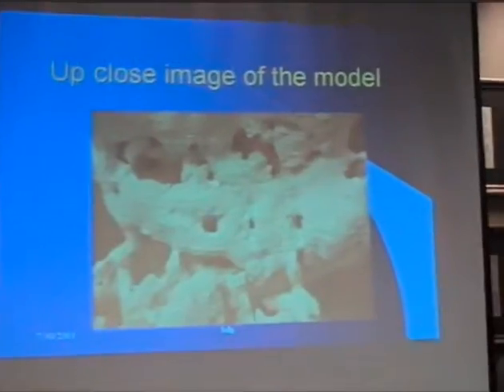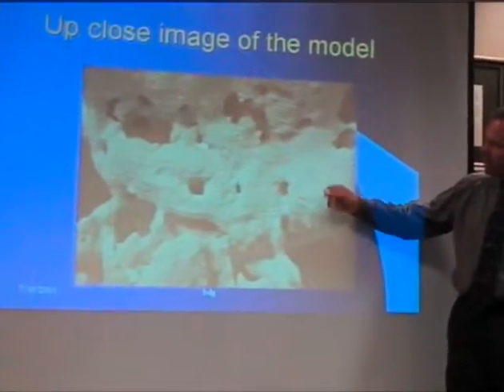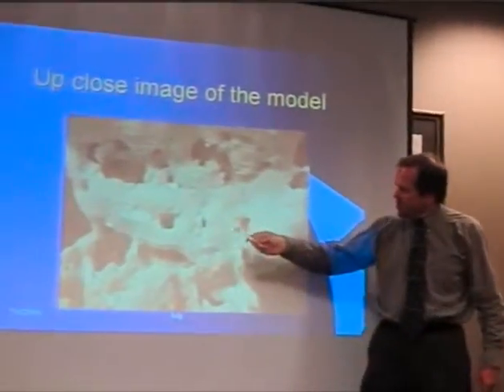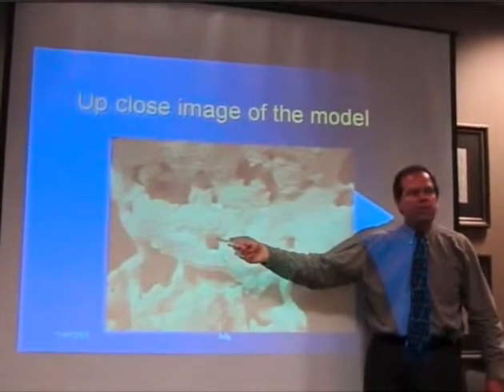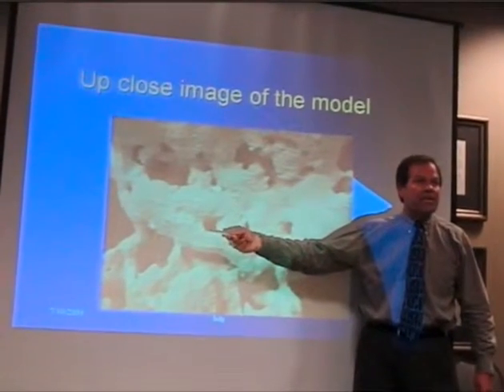And here's another piece. There's a fine detail, and you can look in here and see the striations, and that's related to the layer by layer build. So this thing has got defects in it too, because it's building up only on certain size layers. But clearly, there's a characteristic pore size here that's getting into these graphitic particles that you might be able to pick up if you do an absorption-desorption experiment. You ought to be able to see something related to the hysteresis of that size pore.